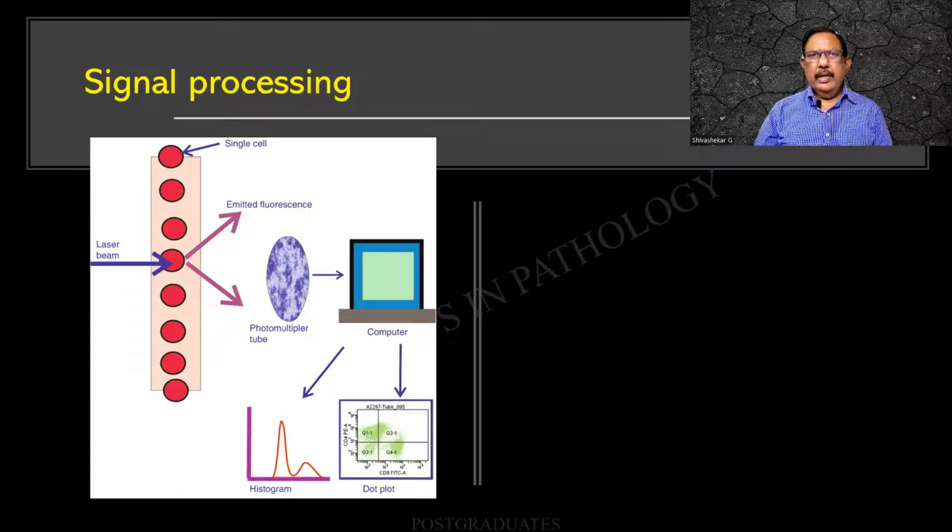But then you people should remember that there will be anterior posterior, there will be the lateral, there can be one oblique and another oblique, and finally there can be a circumferential one. So I have got 7 dimensions that are there.